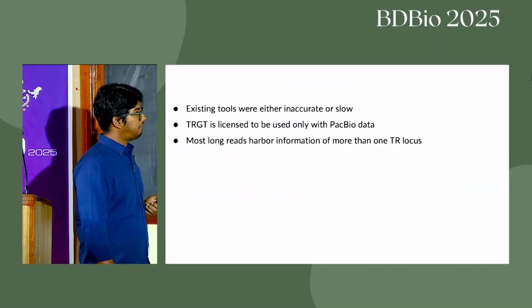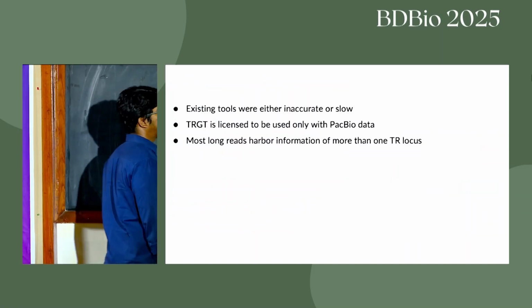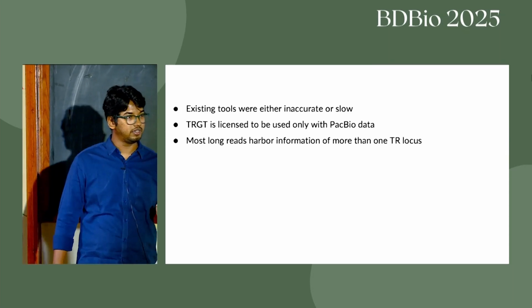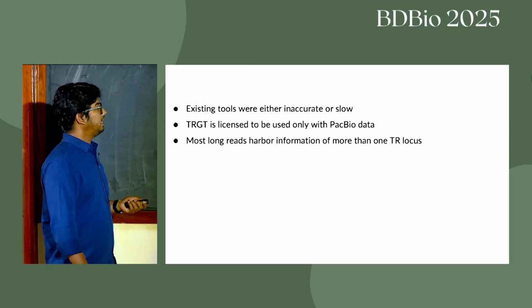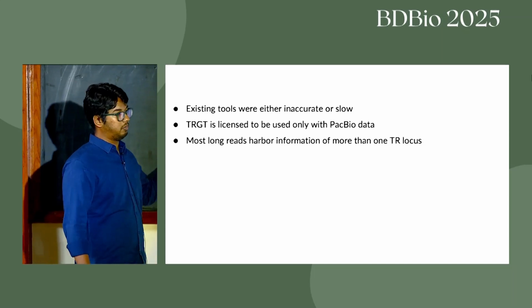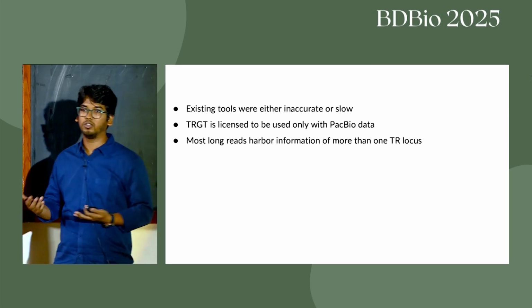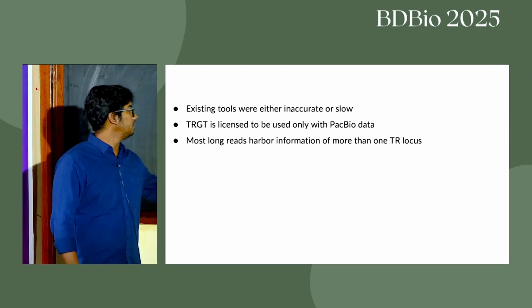The reason why we started working on ATaRVa is because when we started using these tools, we saw that they were either inaccurate or inefficient, right? And also, like I said, one of them can only be used with PacBio data, and we were mostly dealing in-house with nanopore data, right?